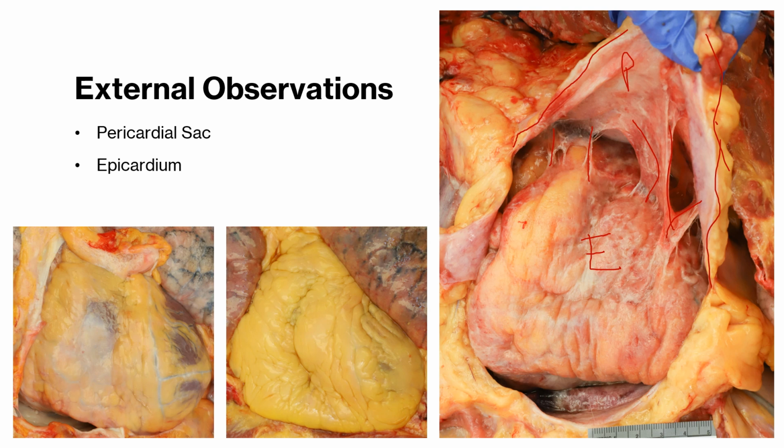Next, we want to look at the heart in the middle here, the bright yellow one. When I was showing the last heart with exposure of the muscle, here you can just see adipose tissue. So this is definitely an abundance. I wouldn't call this a normal presentation of epicardial surface adipose tissue. I would, in my report, definitely call this increased. And it also is correlated to obesity as well as atherosclerotic cardiovascular disease. So it's a good indication for what you might find elsewhere in your autopsy as you work through the process.